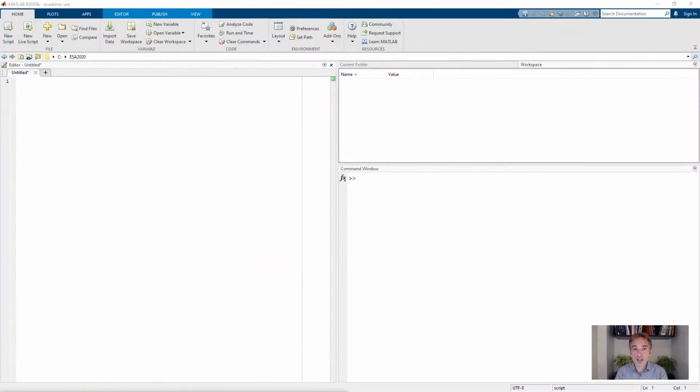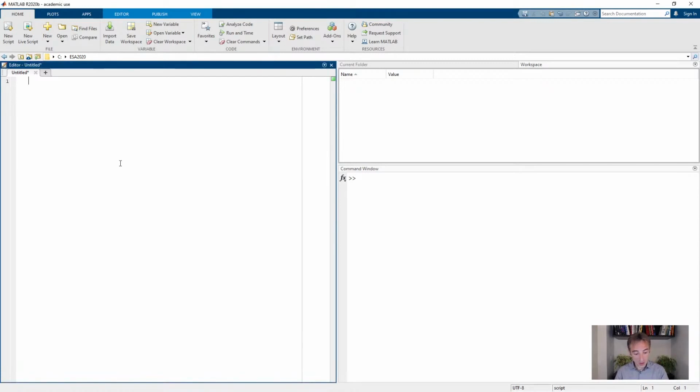Garlic is the function for the isotropic limit. So if the molecule tumbles really fast, everything averages out and you get just a series of sharp lines. Okay, let's start out. Clear. I always do clear to clear out the workspace of any leftover variables that might interfere with what I'm doing. Let's define a spin system for a simple radical.